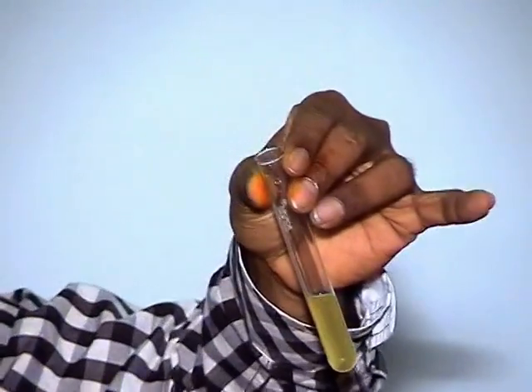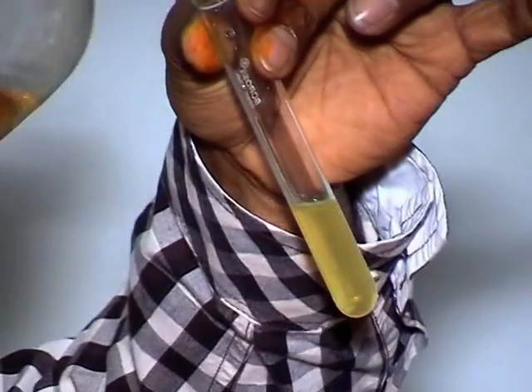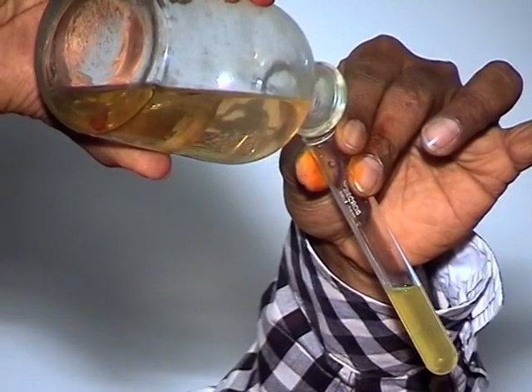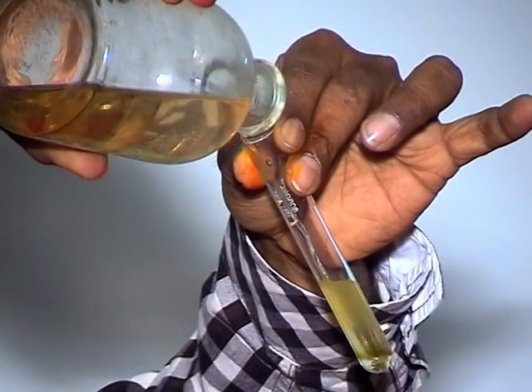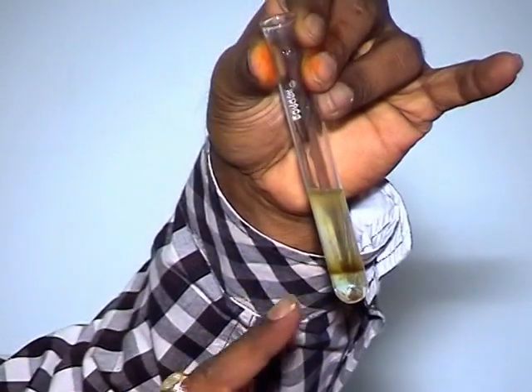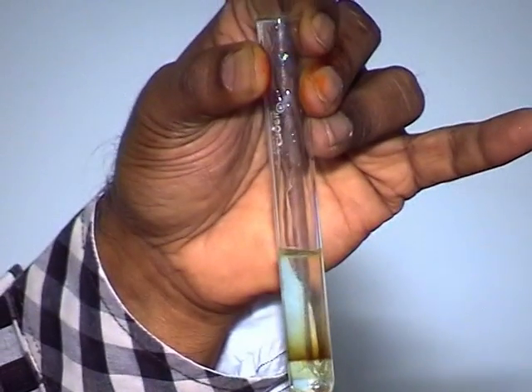Then keep the test tube in a slanting manner. After keeping the test tube slanting, add concentrated sulfuric acid along the inner walls of the test tube. Now you will find a beautiful brown ring. This is the confirmatory test for nitrate.